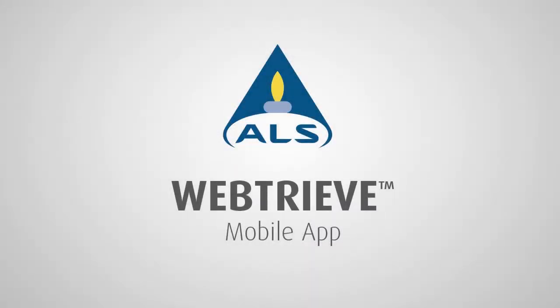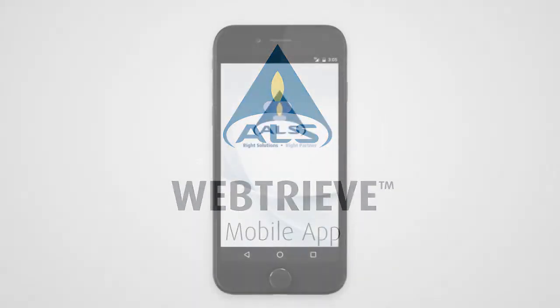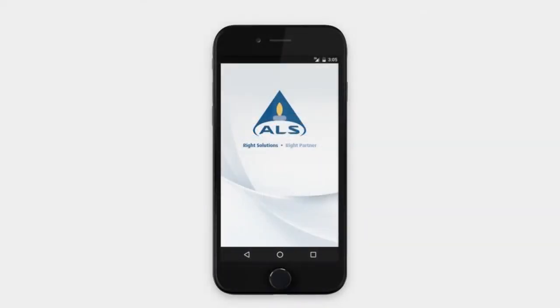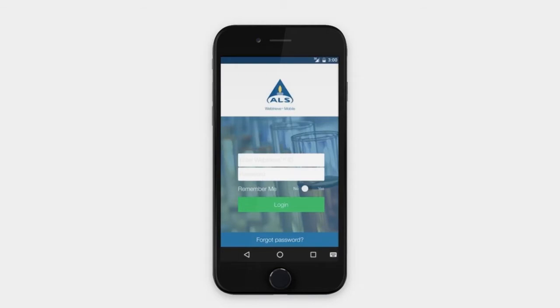Welcome to the latest version of ALS Tribology's mobile app. Webtrieve Mobile provides convenient sample alerts as well as a new feature allowing for sample submission. This video contains a quick tutorial of the ALS Webtrieve mobile app features.